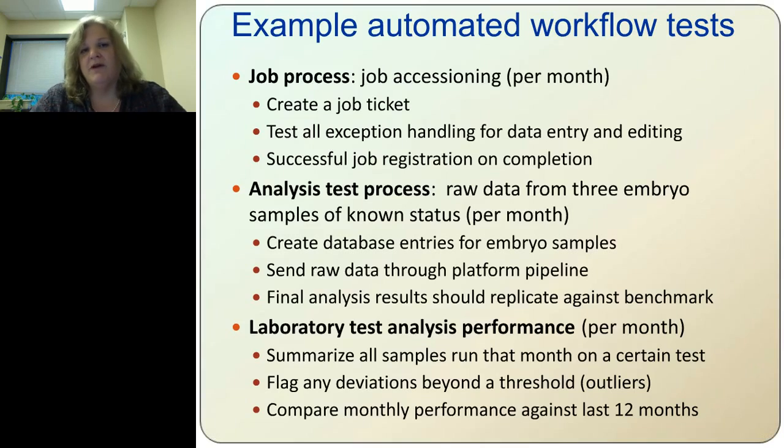So you'd run February as a benchmark, and every month when you run your test, also run another test with expected results. So you're not going to show that, but you'll say that the test parameters you ran should be expected because the one that you knew about how it should run came out to the same value. So that's another way of doing a test analysis performance.